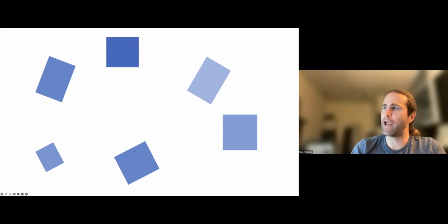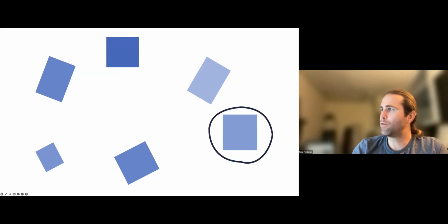So that's what the shading and the rotation and size of these rectangles is supposed to represent, the variability in your population of the anatomy. So to create an atlas from these 6 subjects, the first thing we're going to do is select one of those subjects to be the initial value for the atlas. All you're saying is, you're making the simplest atlas possible.